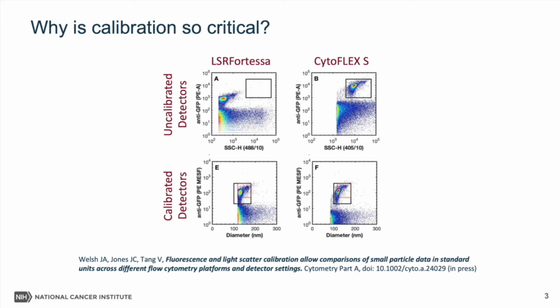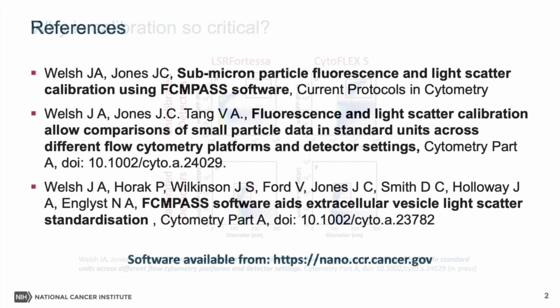I really hope this has convinced you how quick and easy it can be to perform calibration, as well as the huge benefits that there are to utilizing it. I've also put some references here to the papers that are relevant to the development and the implementation of the software, as well as our website link where you can download the software.